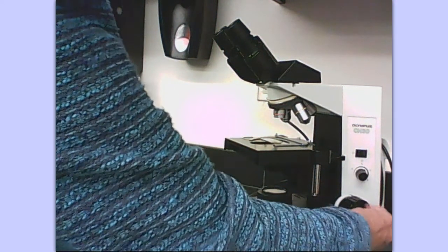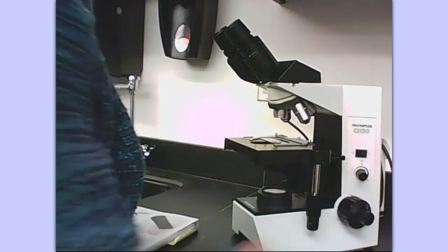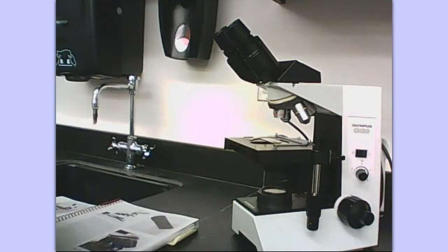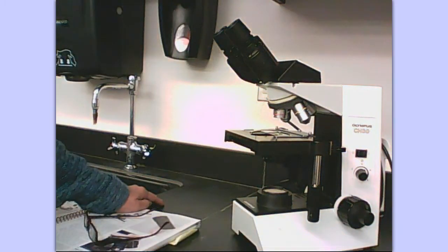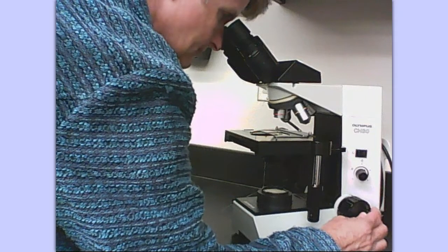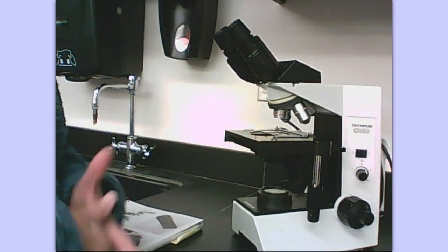Watch when I use the fine adjustment knob — I'm turning and turning that, and you probably cannot even see it move. You get the best focus that you can with the coarse adjustment knob, and then you take the fine adjustment knob and get it fine focused. I'm going to look through the eyepiece, bring it up until it's in coarse focus with the coarse adjustment knob, then use the fine adjustment knob to fine focus and clear up the field of view.